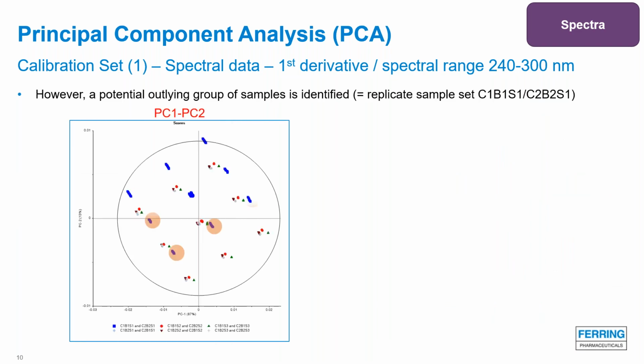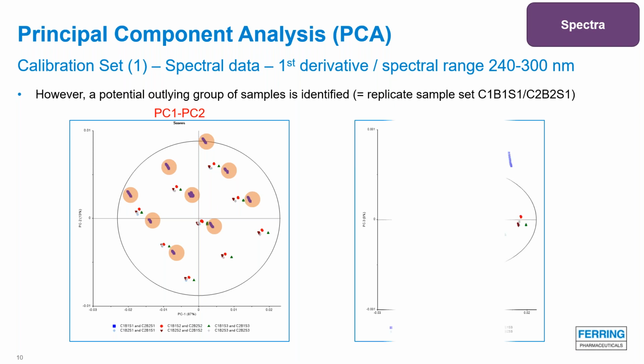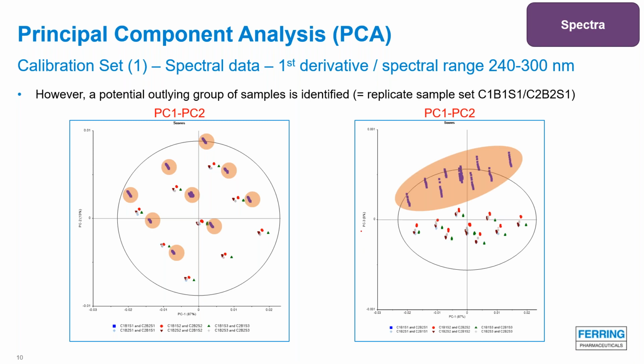Here I'm plotting the same graph, and I've just highlighted the blue samples. And as you see, the blue samples seem to be simply similar to the other samples, but just shifted to the top left corner. And as I said, we can actually use another principal component. So now I'm plotting, there is a typo here, it should be PC3 instead of PC2.